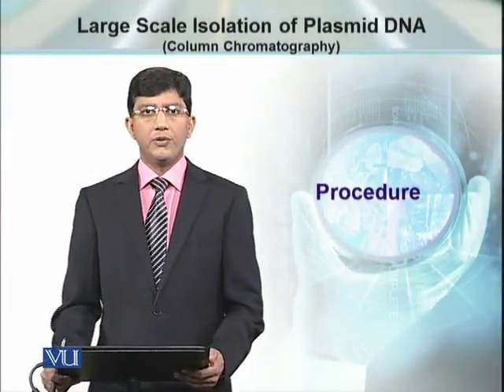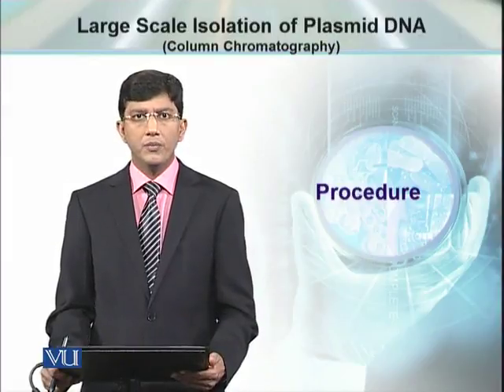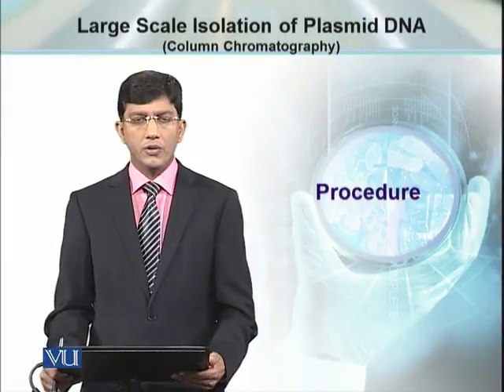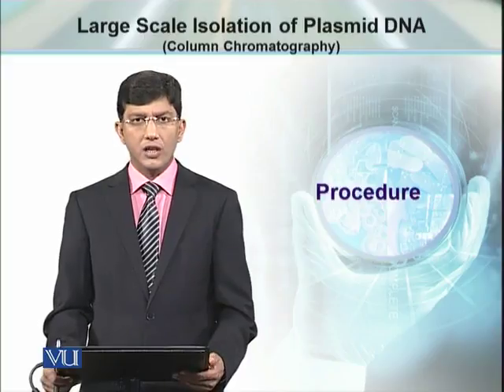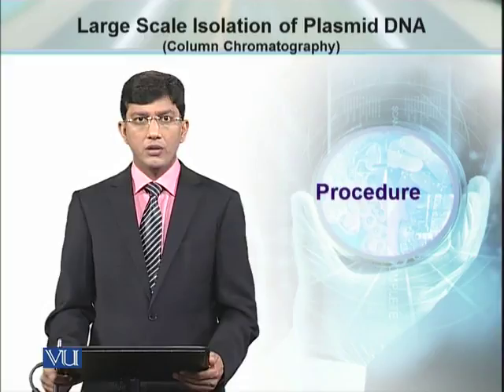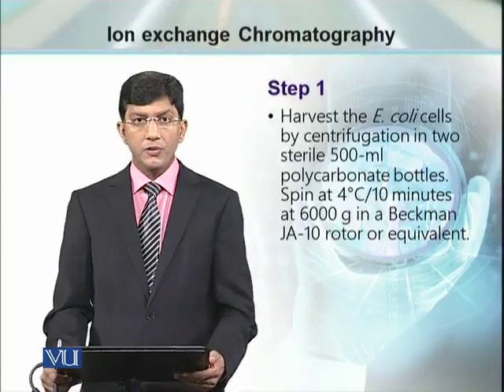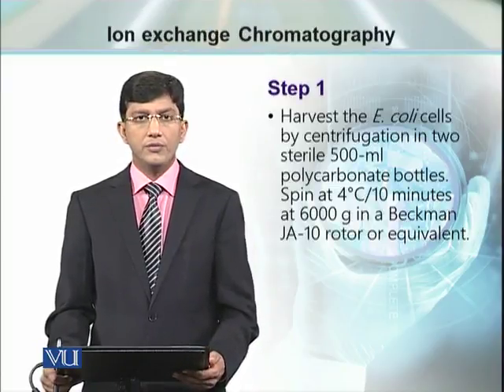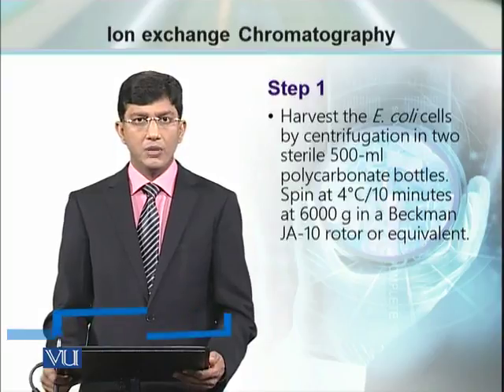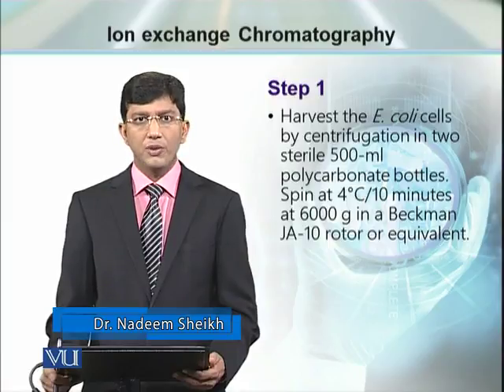After making all the preparations, after arrangement of all the equipment and availability of all the buffers, now this is the time to proceed further and start the procedure for plasmid DNA isolation using the MaxiPrep method. The first step is the harvesting of the bacterial cells from the bacterial culture, which we established in our previous day's experiment or some earlier experiment.